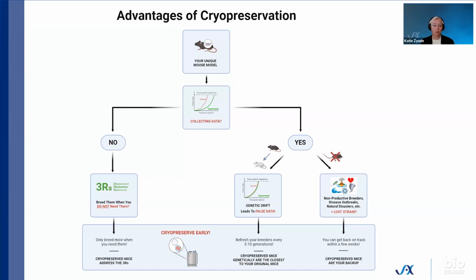For example, if you need to put an experiment on hold for a few months, you have cryopreservation as your backup, you now have 2 additional options that will ensure that the animals are not being wasted due to unnecessary breeding. If you cryopreserve, you can always go back to your cryostock, and therefore you can easily reduce your colony size to just a couple of breeding pairs without running a risk of creating a genetic bottleneck, or you can completely remove the strain from the shelf until you are ready to restart your experiments. Both steps will reduce the number of animals wasted without an immediate impact on your study results.